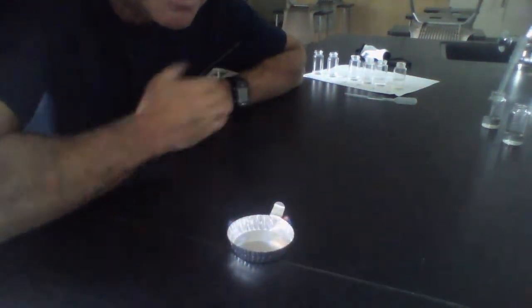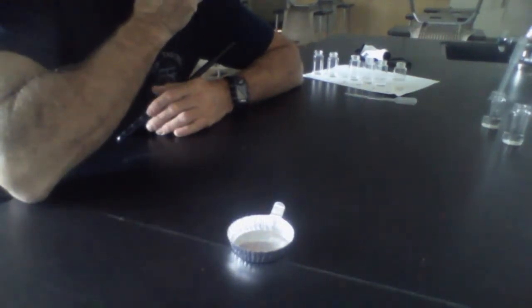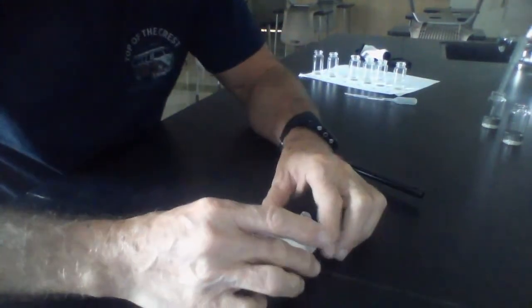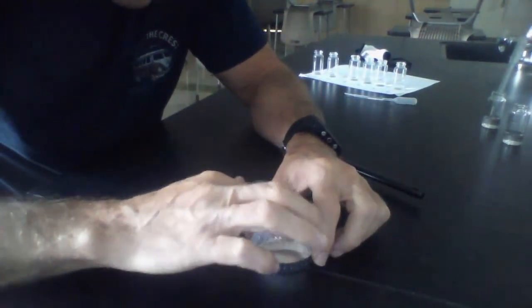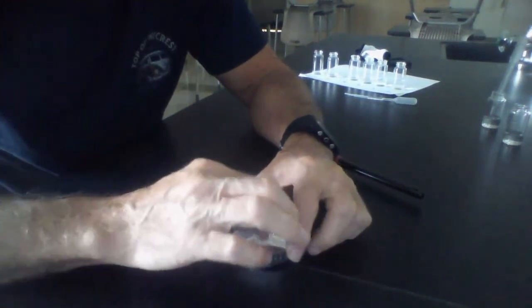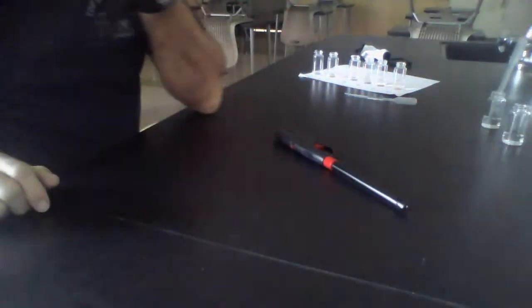I got those droplets moving around. I don't want to hit it with any wind, and gone. It did a similar thing with the candle, little floating candles moving around. I wonder what that's due to. And it formed two of them, and then they went out, and that was it. I believe we only have one more now. It's n-butanol. So we are still safe.